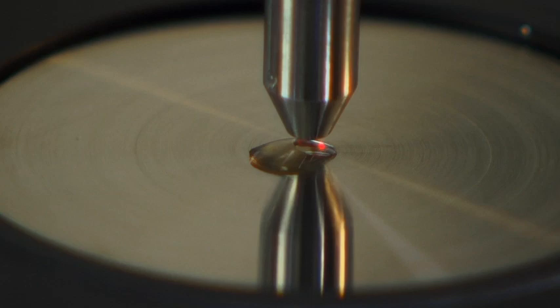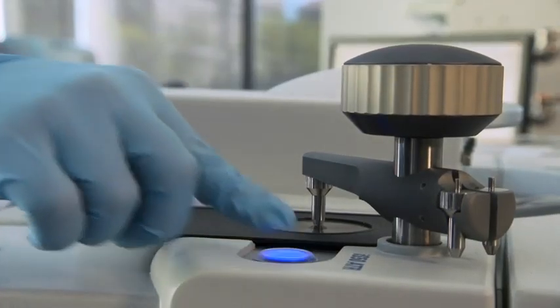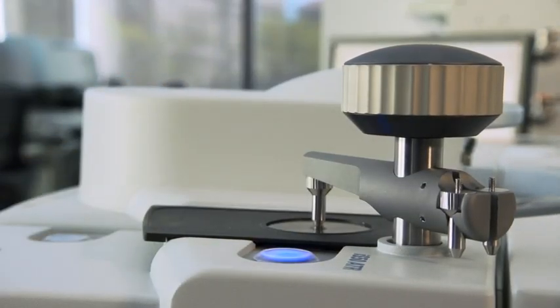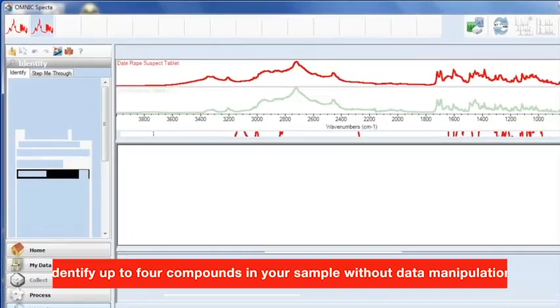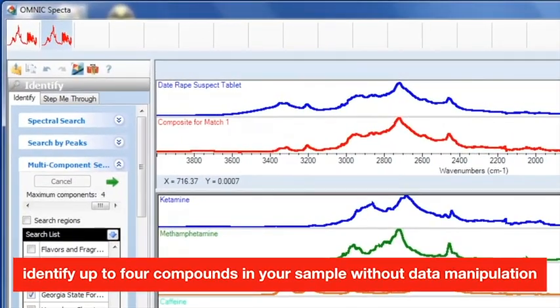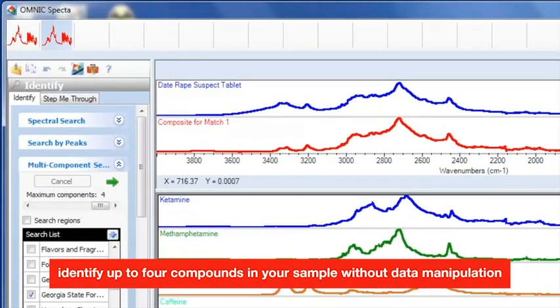Just prepare your sample, press the touchpoint, and the Nicolet IS50 automatically does the rest. Once your spectrum is collected, the exclusive Omnic Forensics Package lets you identify up to four compounds in your sample quickly and easily, without data manipulation.